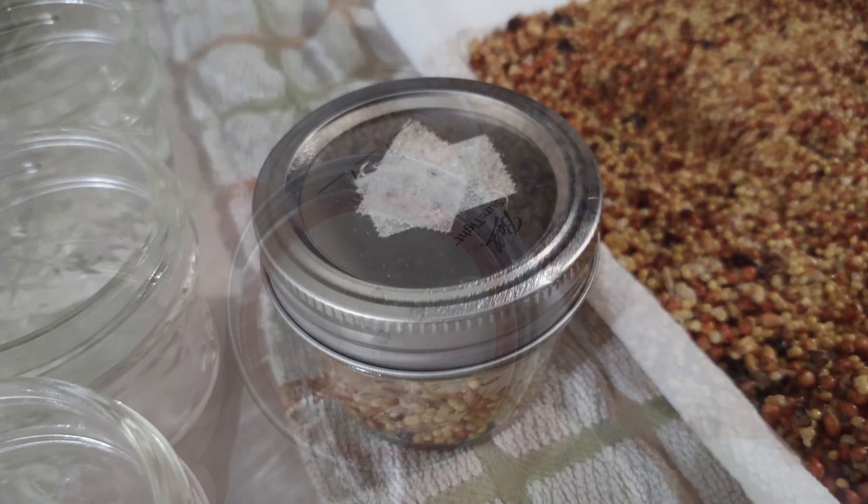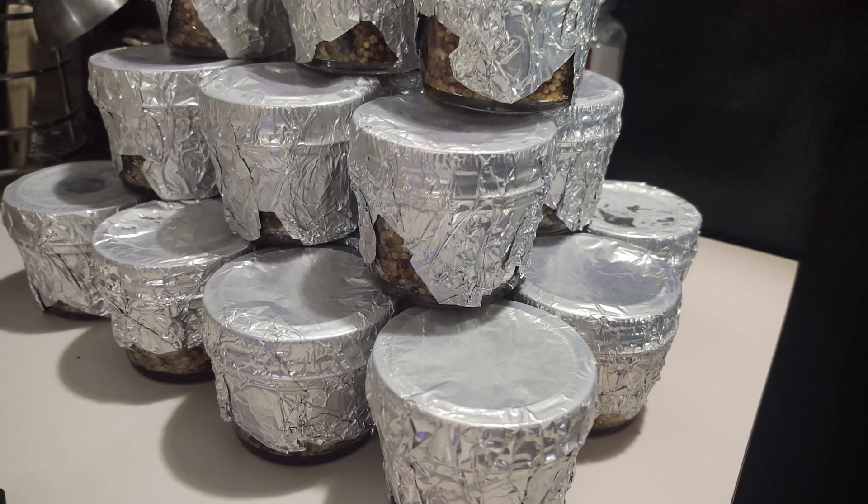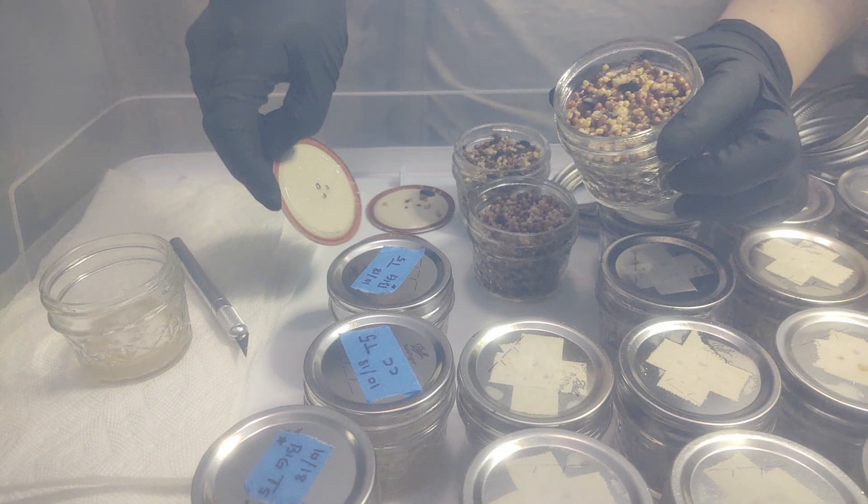WBS, or wild bird seed, is one of many different types of grain spawn that can be utilized. Rye berries, millet, and popcorn are other examples, but WBS is our favorite and has shown itself to be an excellent spawn for growing out all types of mycelium.